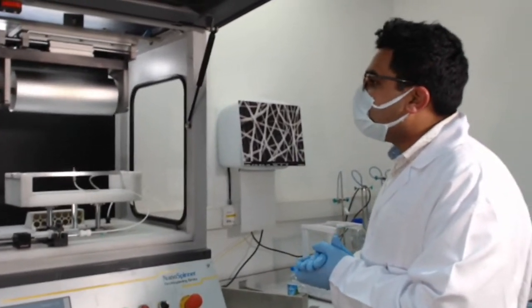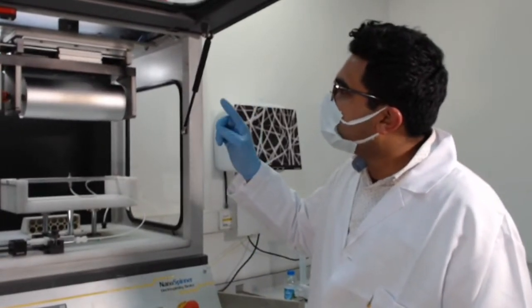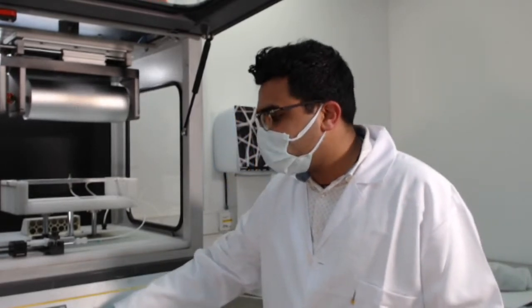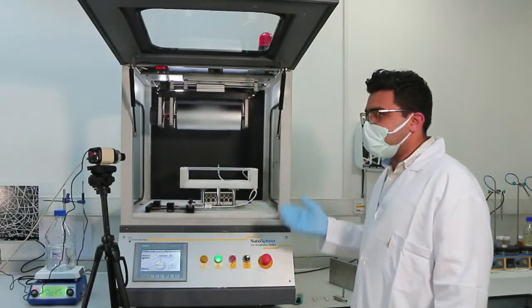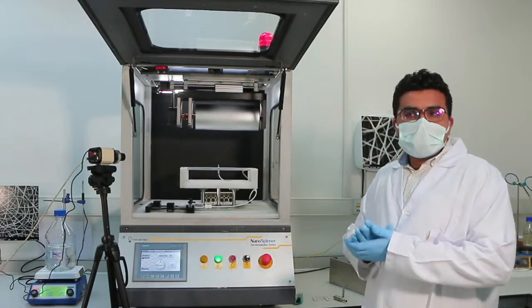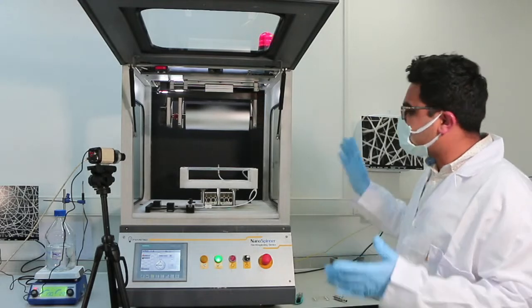Also, in the chamber we have a temperature and humidity sensor. It tells you the temperature and the humidity of the process happening. So this covers the essential process. I guess this is the core essential of electrospinning.